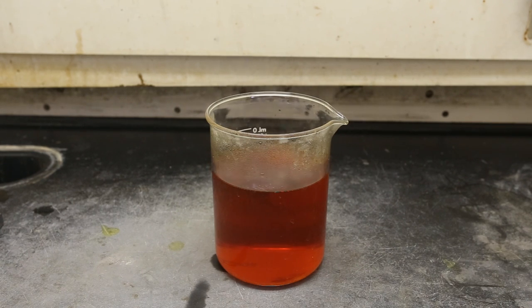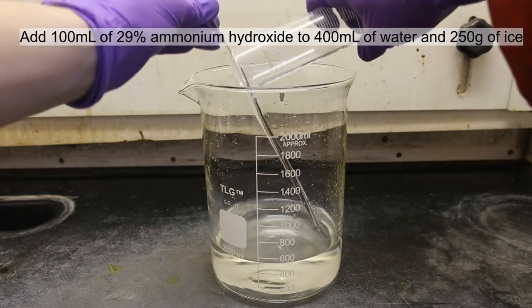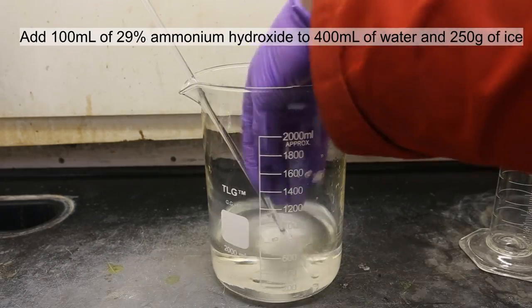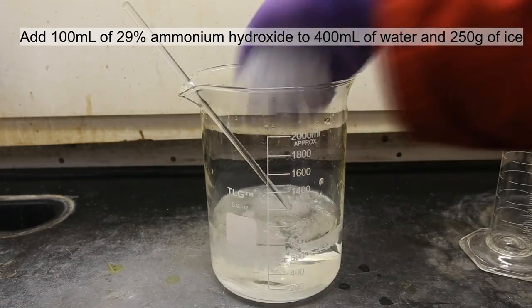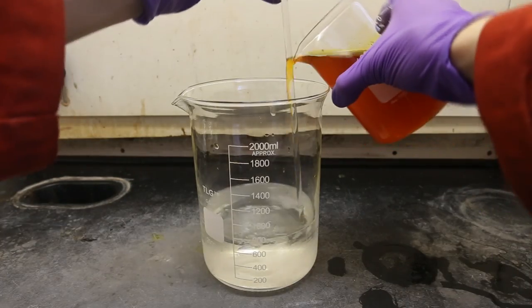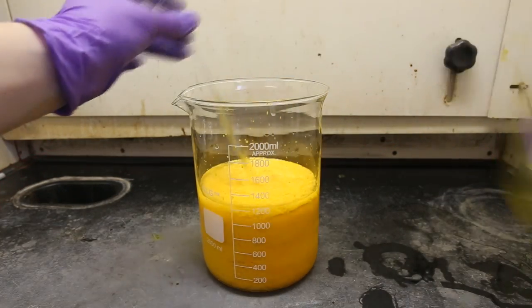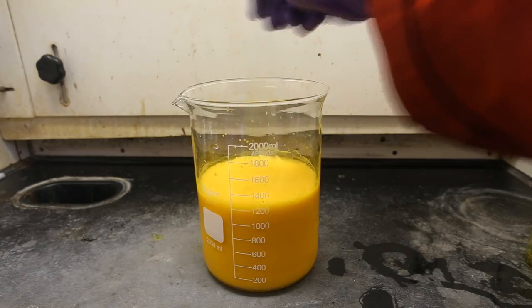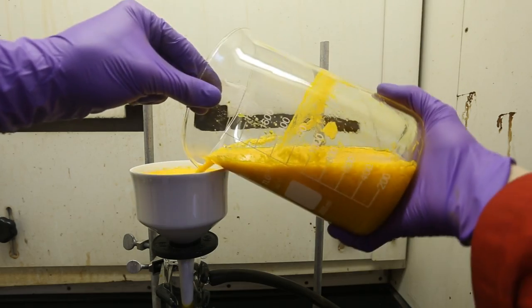In the meantime, you should make a cold ammonium hydroxide solution. The ammonium hydroxide solution that you need to prepare consists of 400 milliliters of water, 100 milliliters of ammonium hydroxide, and 250 grams of ice. Once your reaction solution has cooled to room temperature, add it to the ammonium hydroxide solution. Your product should immediately precipitate. Then, filter off your solution.